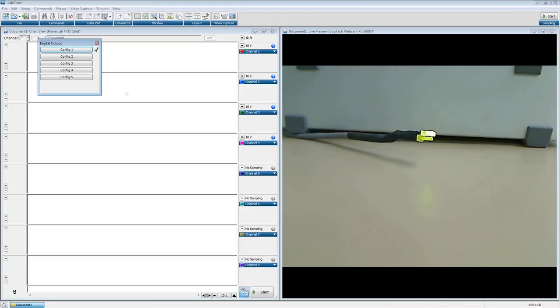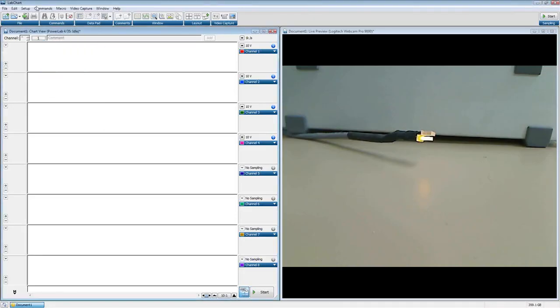I want that manual control. There's ways to automate this that we're going to talk about later on, but this is the most rudimentary use, very, very simple. Only manually are we controlling anything. It has to be something that the user does here with a mouse click. And I'm left mouse clicking on these buttons here to apply the different configurations. So pretty simple, pretty straightforward.